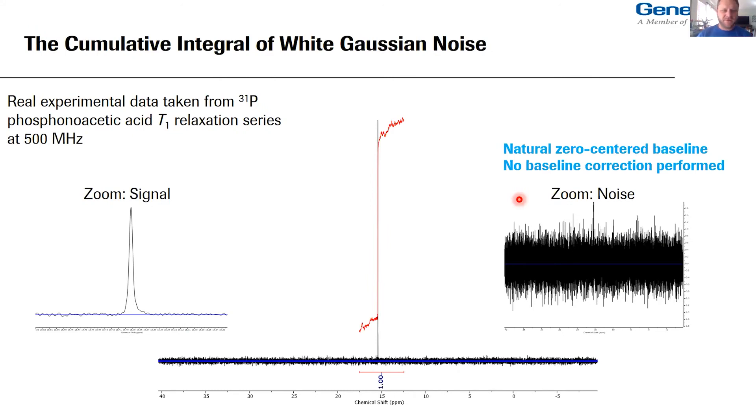Here's some real experimental data taken from a P31 phosphonoacetic acid T1 relaxation series on Jose and Dave Russell's 500 MHz magnet. I want to emphasize that this baseline is naturally flat — no baseline correction was applied. On the left is a zoom of the signal, a nice Lorentzian, phased pretty well. On the right is a blow-up of the noise strip with the baseline emphasized — essentially as close to zero as you're going to get naturally. But when we sweep a very generous integral we see that the two extremes of the cumulative integral are not quite flat.